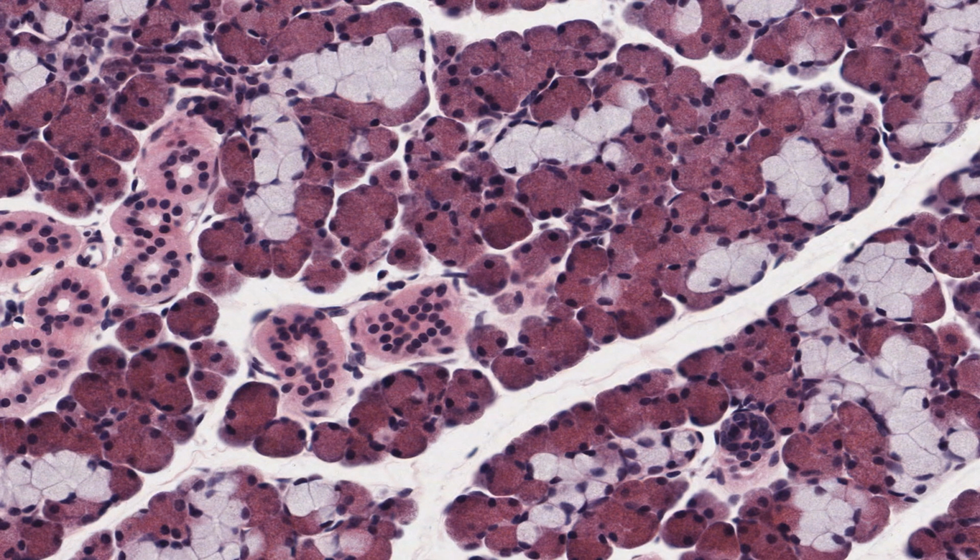Mucus-secreting cells are pale stained, with each of their nuclei flattened against the cell base. They're closely related to the goblet cell. The serous-secreting cells would normally stain intensely with hematoxylin in their basal regions. But I think here the cells are so packed with eosinophilic secretory granules, this basophilia is hidden.